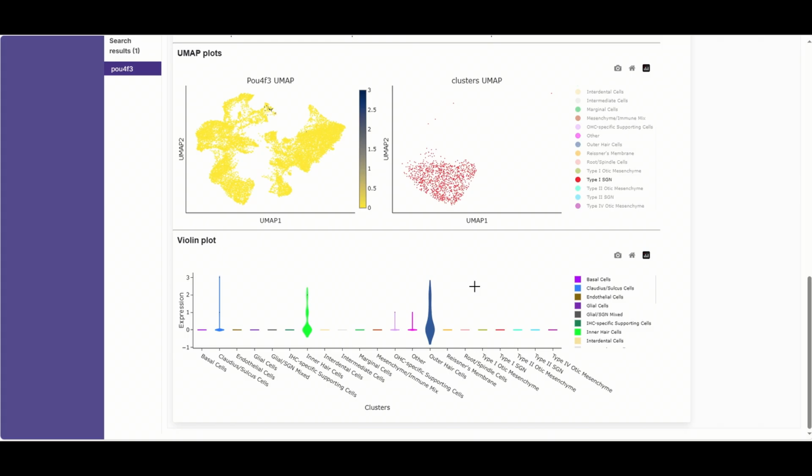Moving forward, our team is committed to generating reference datasets using spatial platforms spanning from embryonic to adult ages of mice. It's our hopes that the auditory field can use these datasets to bolster their transcriptional studies by comparing cell annotation with their own personal datasets. Perhaps they can describe regional changes in expression not previously seen, and identify novel cell-to-cell interactions within the cochlea. We're so excited to see the unique and new ways that gEAR can be used to help you with your studies.